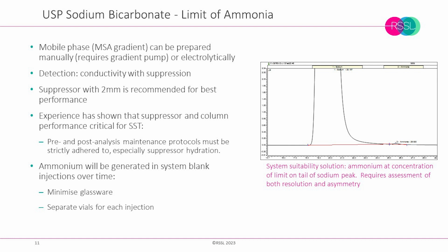As the test is a limit test for ammonium, which is fairly prevalent in the environment, we have found it is advisable to limit the use of glassware as much as possible and use separate vials for each injection, especially during long sequences, to limit the dissolution of ammonia from the atmosphere.